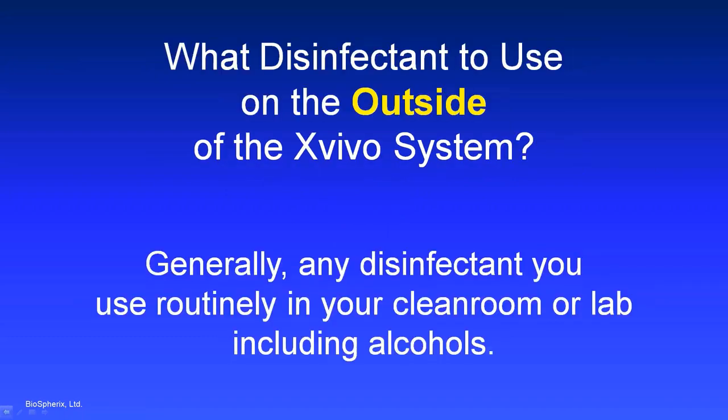Oh, I will say before I leave this that we did have one customer that came to work in our Xvivo showrooms once that wore heavy makeup. Now, you can't wear makeup in a clean room, but she wore makeup to come work here, and by the end of a workday, the Xvivo system glove front was wearing a lot of that makeup. And people are people, and people sneeze, and they don't want to share germs with the next person that's going to come work in that system. So please feel free to clean the outside of that glove front frequently with alcohol or another convenient disinfectant.